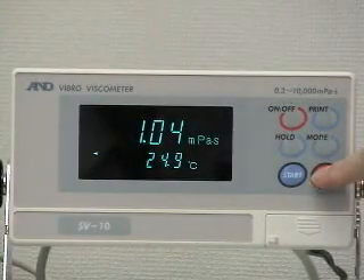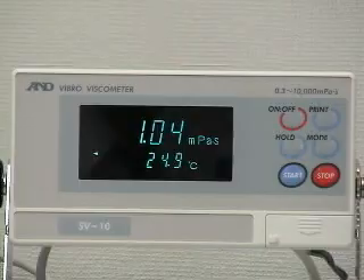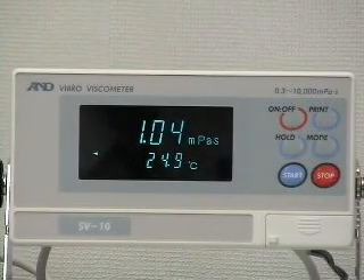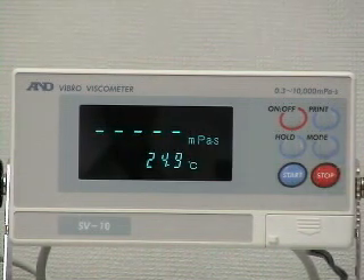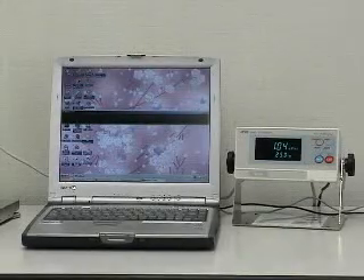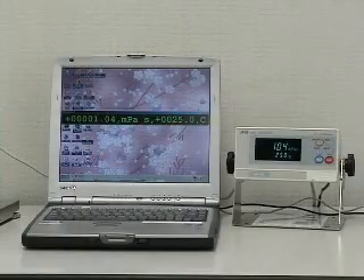Press stop to end the measurement. The processing indicator disappears, the hold indicator appears, and the measurement results are frozen. Press the stop key again and the display goes into standby mode. Press the print key to send the measurement data of viscosity and temperature via RS232C.